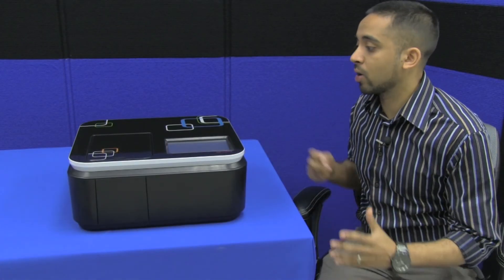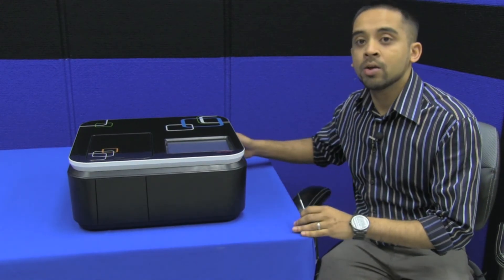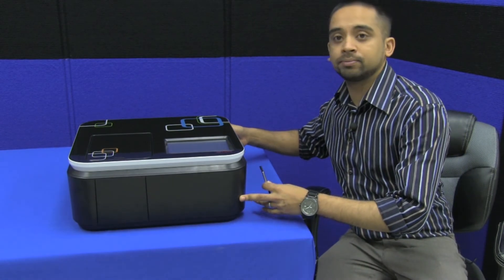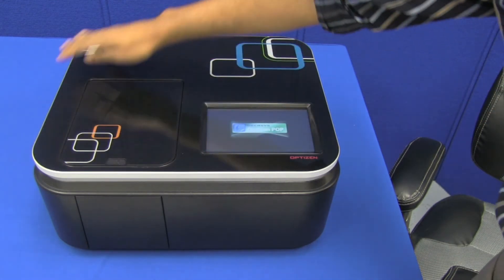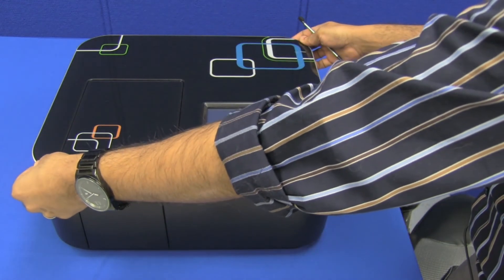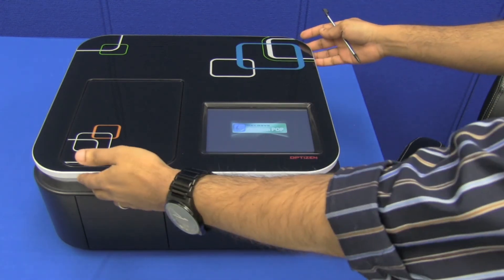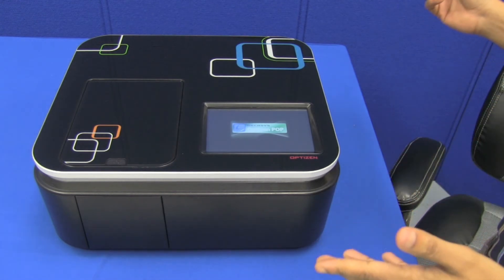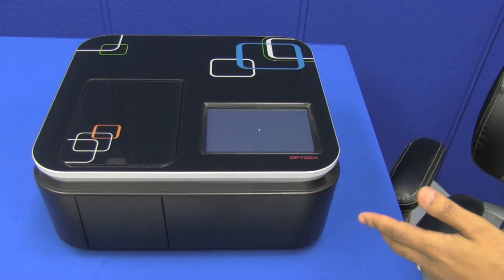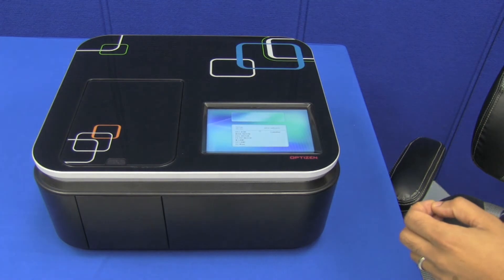Now that we've had the general hardware overview of the instrument, we can take a look at some of the software aspects. We start off by turning on the instrument by clicking the switch on the back. While the Pop is starting up, I want to point out this large panel here — it's actually totally customizable. You can change it to the design that you want, which is really quite a nice feature you wouldn't expect to see from an instrument like this.